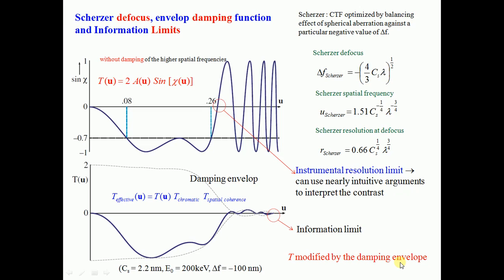So in your TEM, when you want to use the HRTEM feature, what do you need to do? You need to choose the particular potential. You need to choose such a lens, or the applied electric and magnetic field for the lens, such that this parameter should be 2.2, for example, or the defocus parameter in the case of aberration avoiding. So choose these parameters and you will get high resolved images.